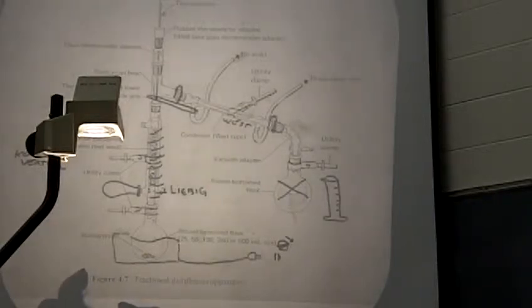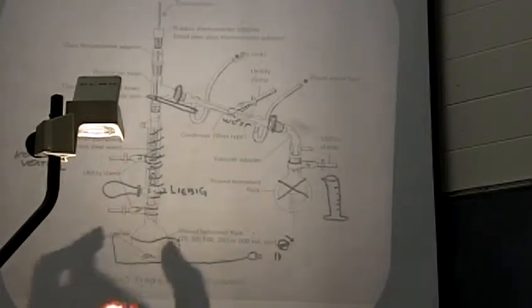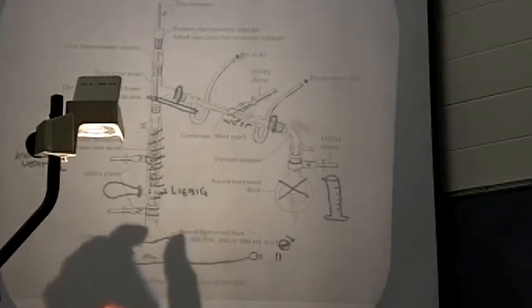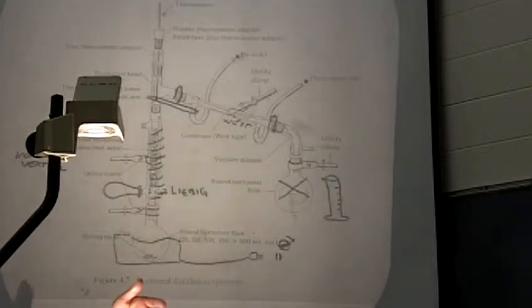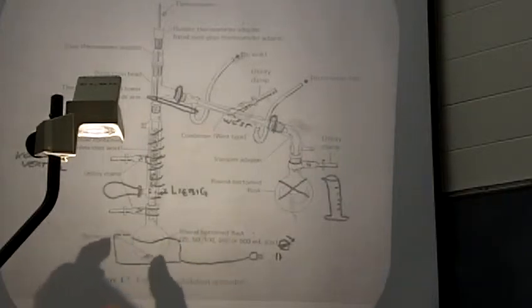You want to be able to stir your mixture, so you want to have a stir bar in there. So have your ring stand, have your stir hot plate. Then you're going to start with your 100 milliliter round bottom flask. The reason we're starting with that is we have a 100 milliliter heating mantle, so the two of them go together well, okay? So you want to make sure that your round bottom flask is clean and dry.